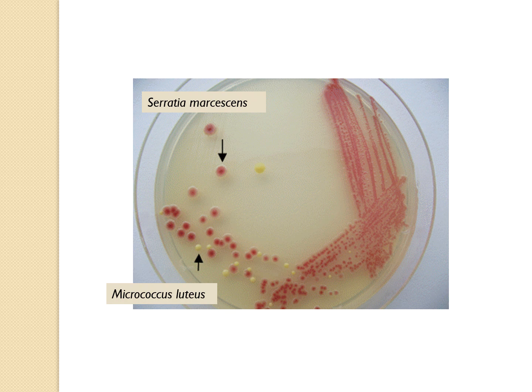And this one's just showing you Serratia marcescens. And you could do the same thing here, right? You could take a good look at this and you could write up a lot of information about the color and the size of the colony and all that sort of stuff as well. All right, so just some quick information there, some terms mostly for you to be aware of.